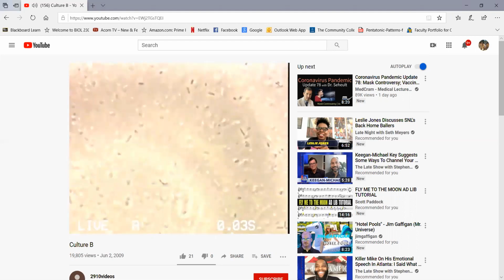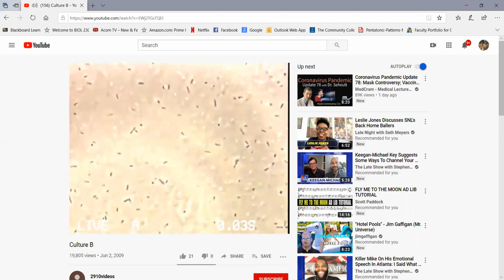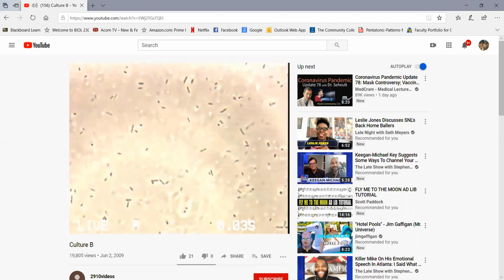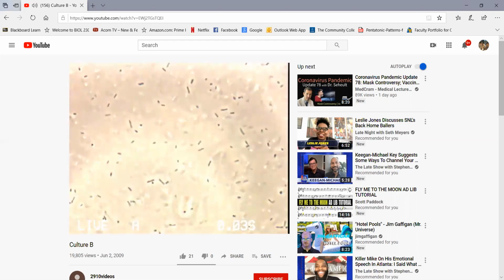So when bacteria are actually swimming, you see them moving very rapidly, frequently many times their length a second, in runs and tumbles, which they use to eventually obtain a more optimum environment. So with the phase contrast microscope, the organism appears darker than the background, but it's done with optics.